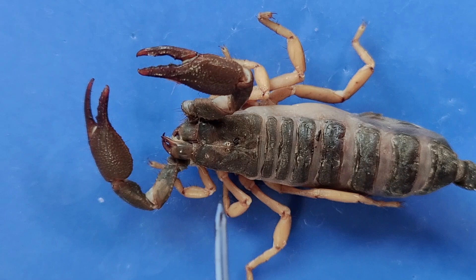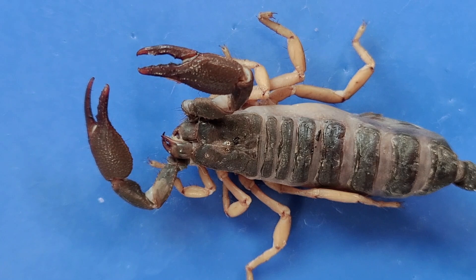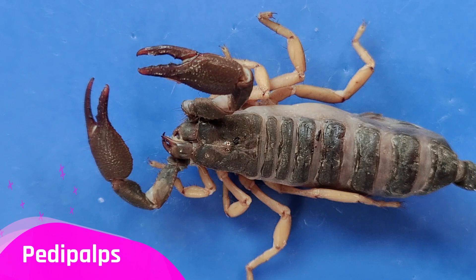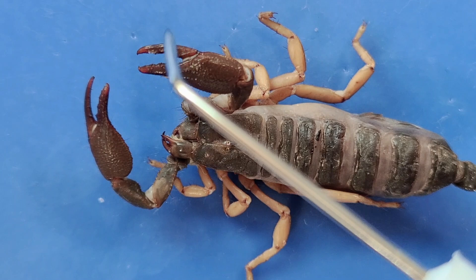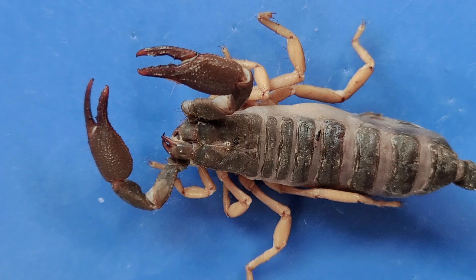This single unsegmented plate that covers the head is called the carapace. The scorpion has two large claws with pincers at the end, called the pedipalps. Each pincer has a fixed claw and a movable claw. This one is the fixed claw, and the other one here is the movable claw. You can see the hinge where it moves, right here.